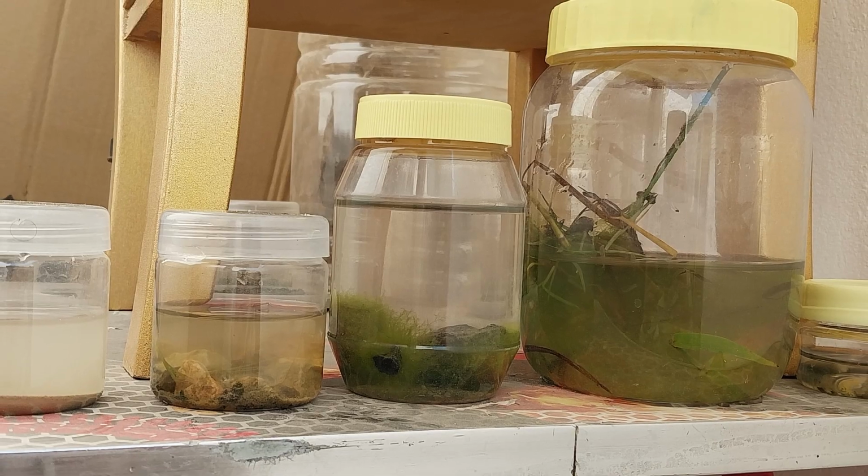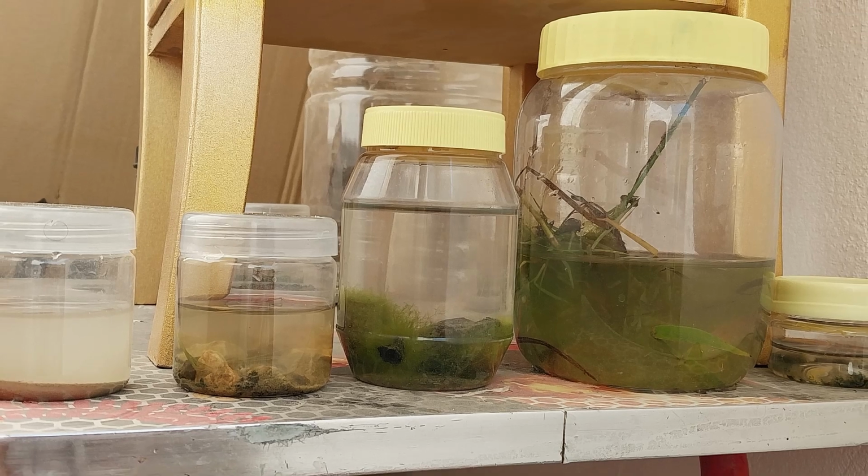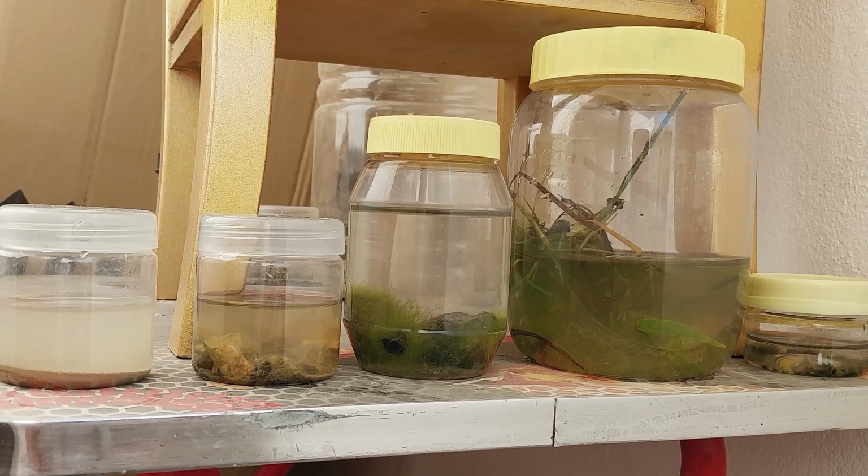I also used that same shovel attached to a selfie stick to collect some macroalgae and plant matter. Then I placed them in a jar. This sample is the one that was shown in the beginning of this video. Macroalgae from a freshwater body contains a wide variety of organisms, including snails, flatworms, and ostracods. I ended up collecting 5 samples in total.